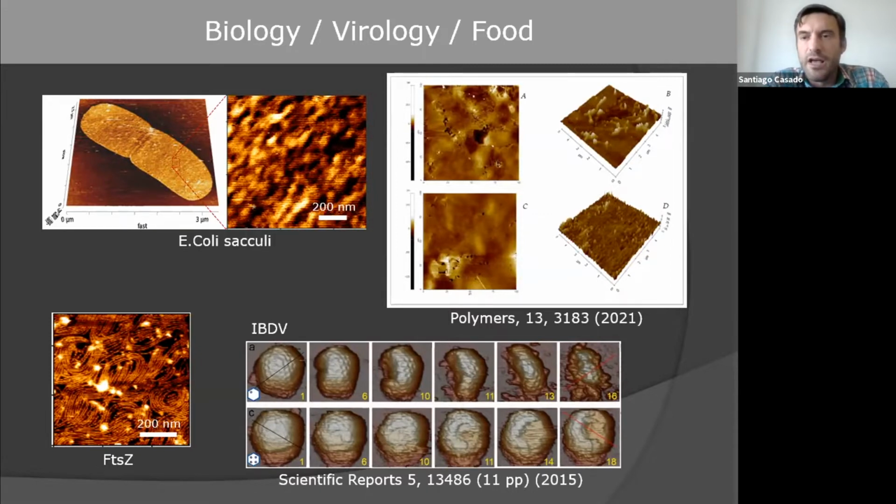And we can check how this peptidoglycan network is affected by the media, because this is something I haven't told you, but probably you know: we can measure with some media in the surroundings. So in vivo, in real time, we can see how the sample is affected by this media. For example, in this other experiment that we did, these are filaments made of FtsZ. This is one of the plethora of proteins that form the septum that helps to divide the bacteria. There are plenty of other ones, but this is one of them.